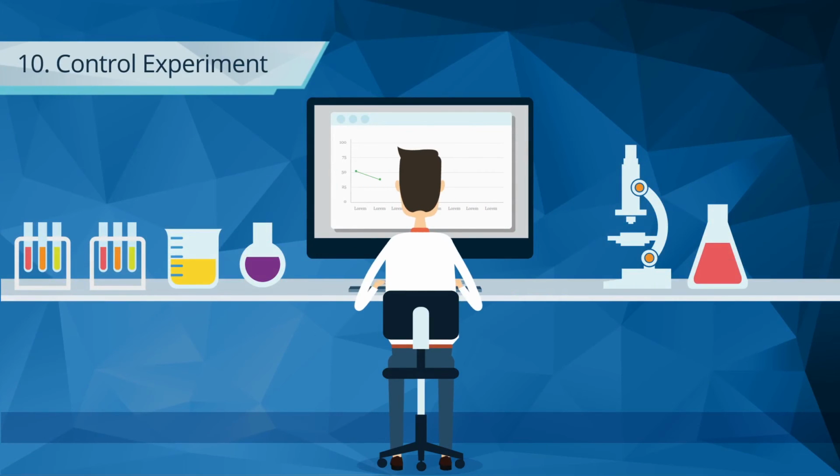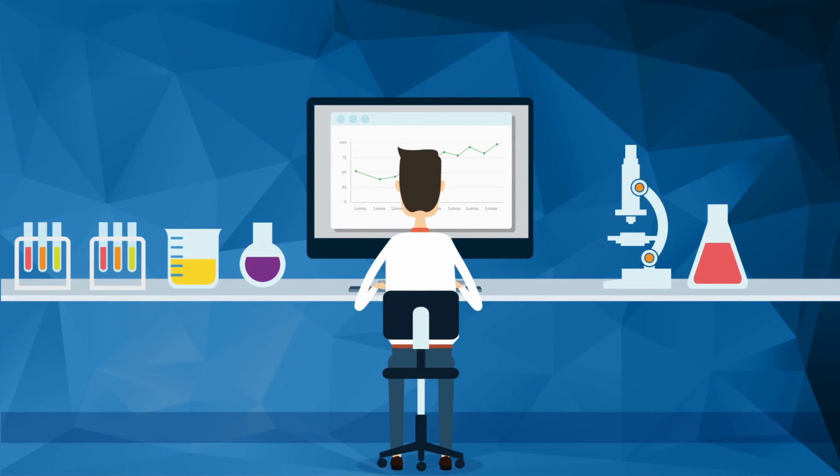Statistical analysis allows us to determine if the levels of protein measured are upregulated, downregulated, or unchanged compared to a control experiment.